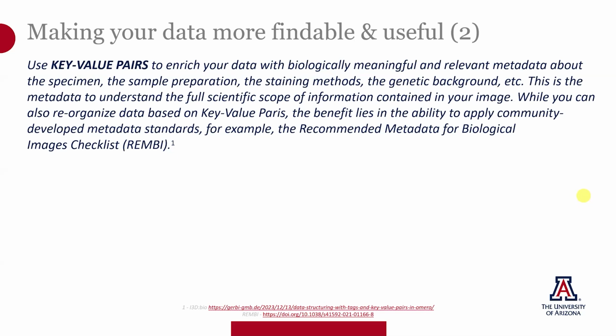You may want to organize your key value pair data by using community-developed metadata standards, such as REMBI, which stands for Recommended Metadata for Biological Images. There are links in the notes below. REMBI includes a useful checklist that your lab can use. Some labs that will be using OMERO will want to keep a separate structured vocabulary document open so that their key value pairs are used consistently.